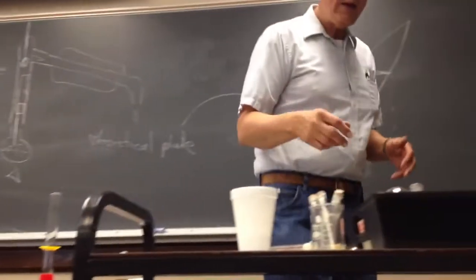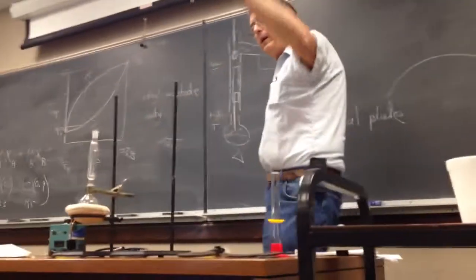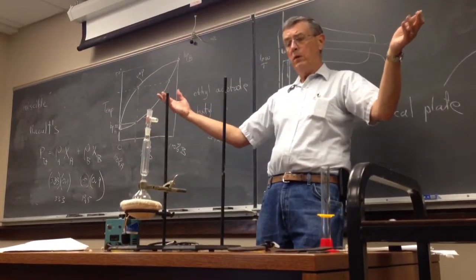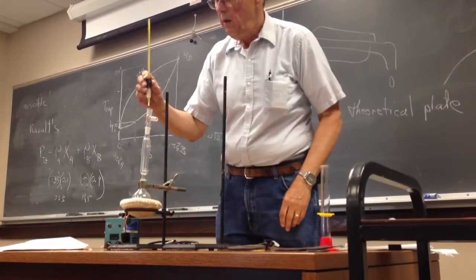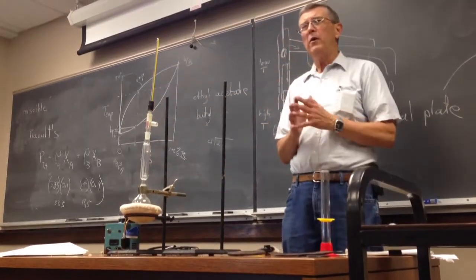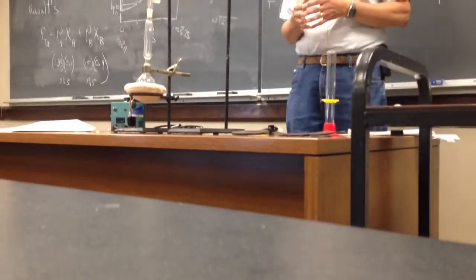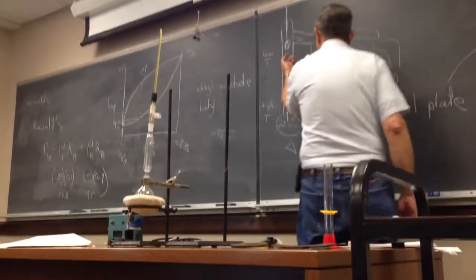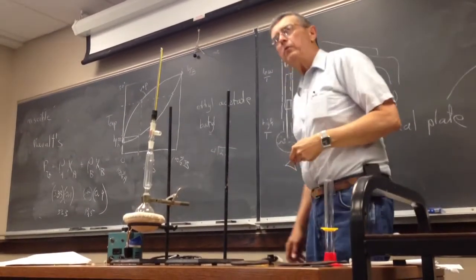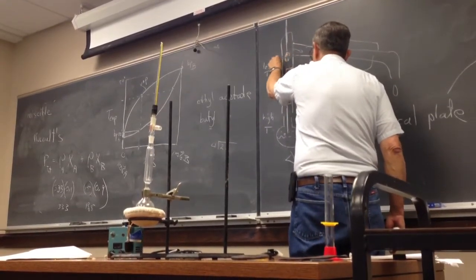I need a redirector, a distillation head, and that's this. It's called a simple distillation head. Put that on. Gravity takes care of it. No problem. Then I need to place the thermometer to get the temperature of the vapors that are coming over. So they're going to be coming up, and they're going to be sneaking over right here, and I've got to get their temperature. So I want the bulb split right there, just like that.